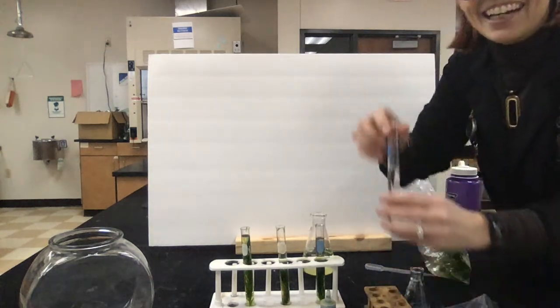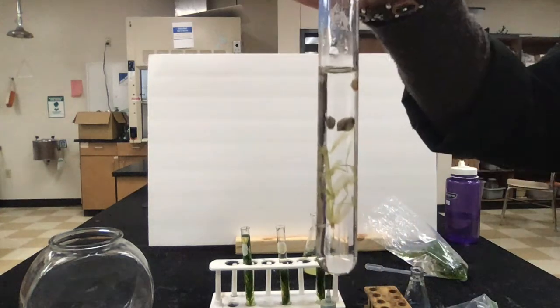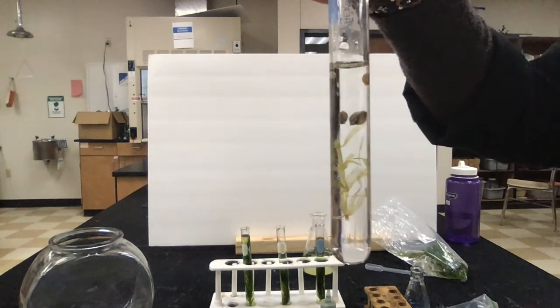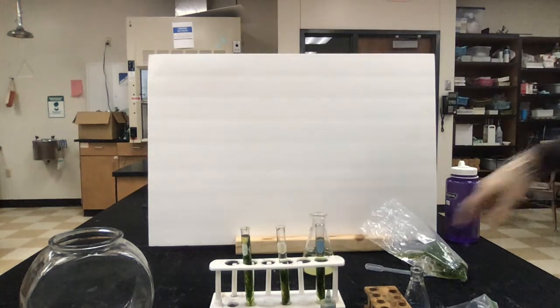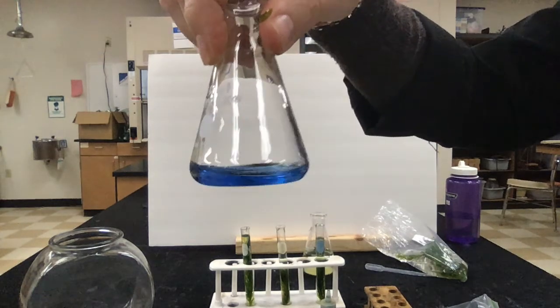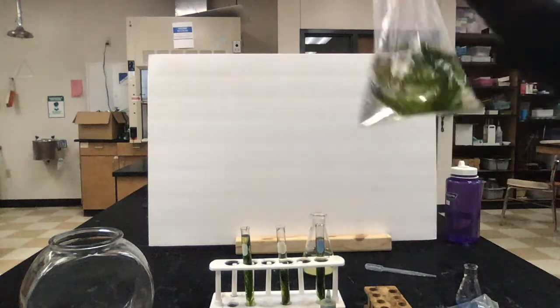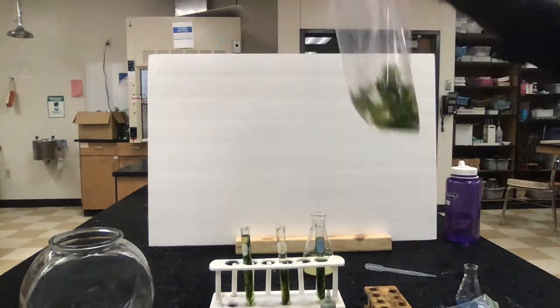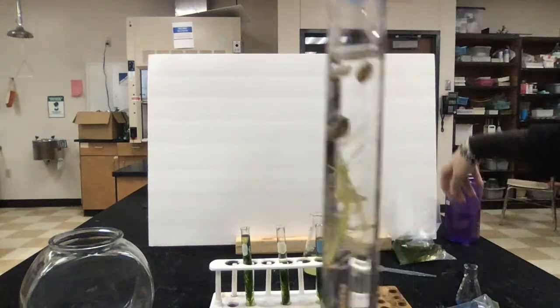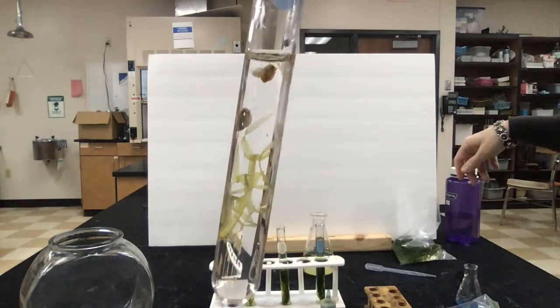In addition, I don't know if you guys can see this. I asked the aquarium store for some snails. And what I'm using is water, do you see the blue color? This is water that came in the bag with the plants, and that's good water for these snails. If I put these snails in distilled water, it would be hypotonic and they would die.